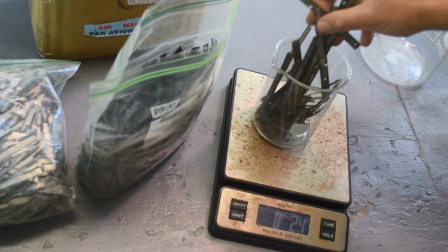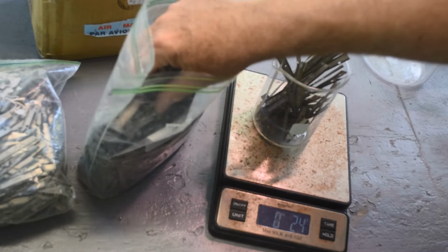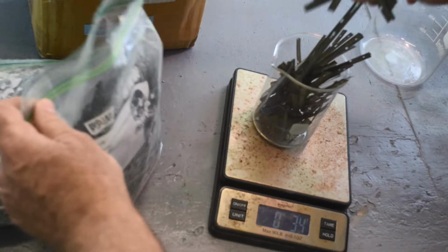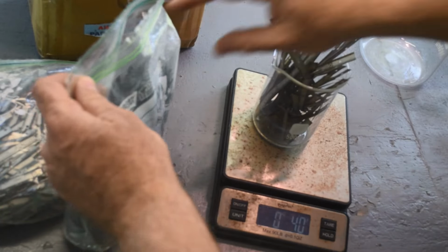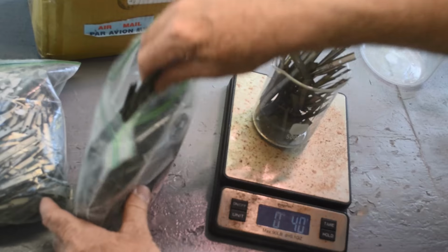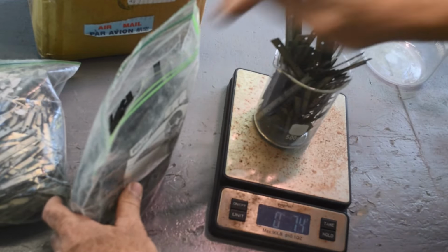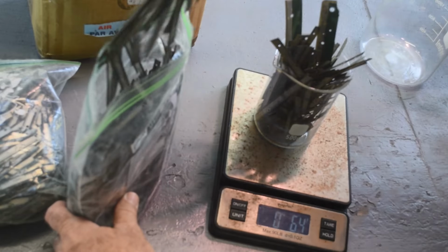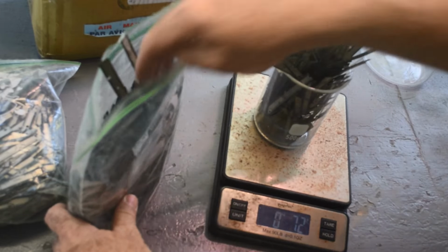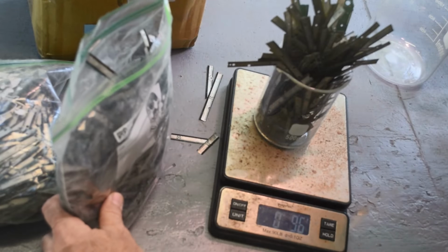Probably have to put it in a taller beaker than this. Some of these things are pretty long, so cut them up, one or the other. Individually, they're very light. This material is quite thin, so 100 grams is going to take a lot of it, apparently. My goodness. Only up to 72. I should have started with a bigger beaker.